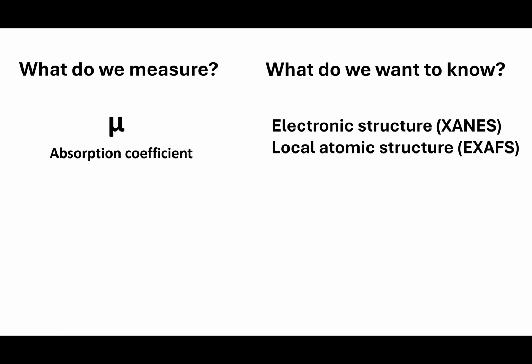Okay, so I will be covering a lot of the theory parts of this, but at the very beginning, I want to point out that we don't have to be scared away by the theories behind this, because as a spectroscopy technique, a very practical and useful way is to measure standards.